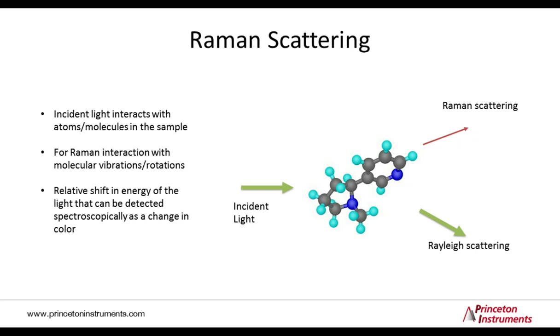Raman scattering is a process where incident light interacts with vibrations of the molecules in the sample. Typically, these days lasers are used for this process, and the laser photons can either excite vibrations in a molecule and lose energy, or pick up energy from existing vibrations that are usually thermally excited.